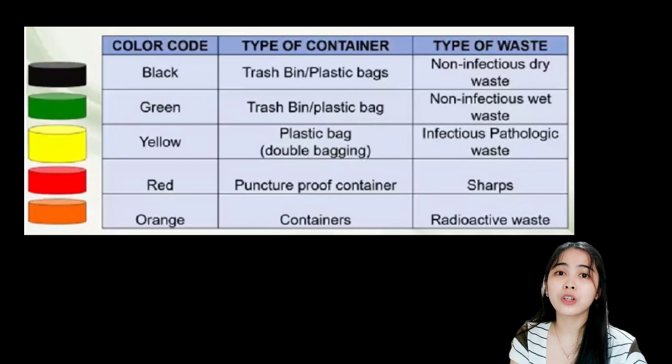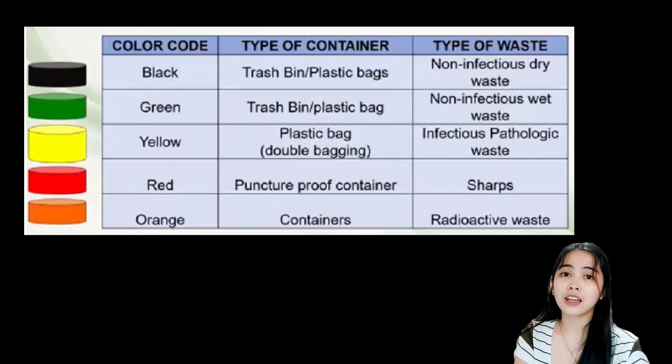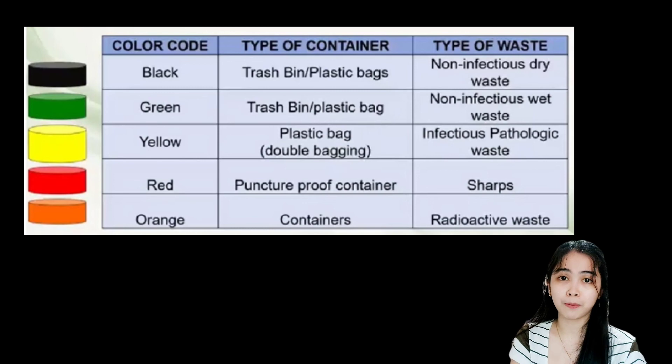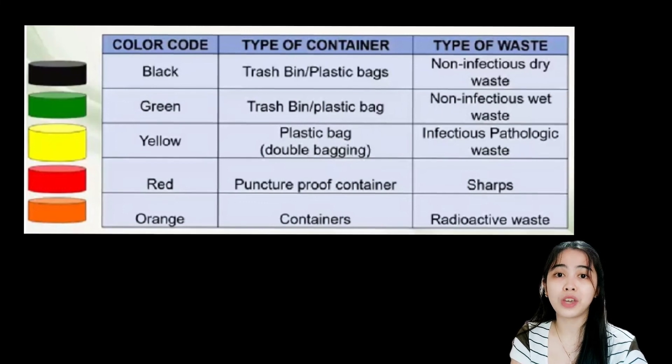Next we have yellow — the type of container is plastic bag with double bagging, and the type of waste is infectious and pathologic wastes. Next we have red — the type of container is a puncture-proof container, intended for sharps. And lastly we have orange — with appropriate containers, for radioactive wastes.